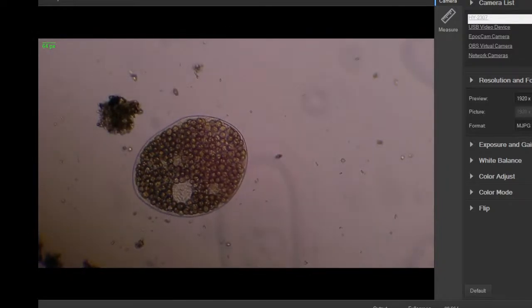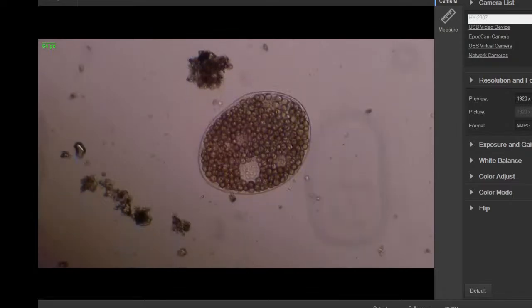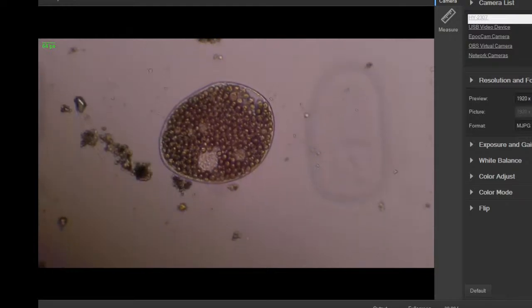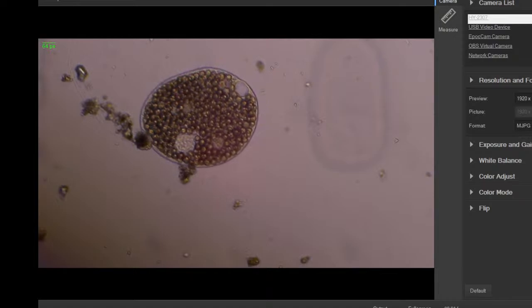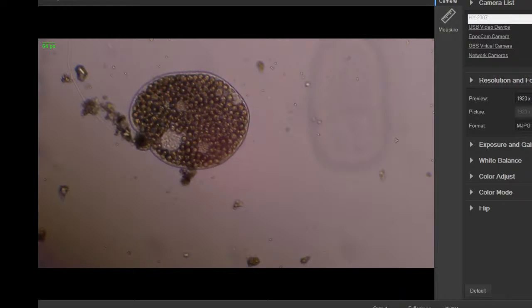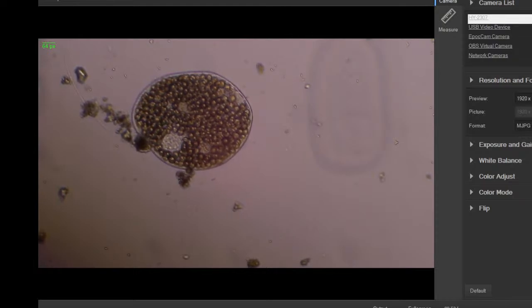A little more contrasty there. Not crazy different, but a little more. That's the back end. Here it goes. There you go. So it's slow moving, but it's still got some cool functions to look at.